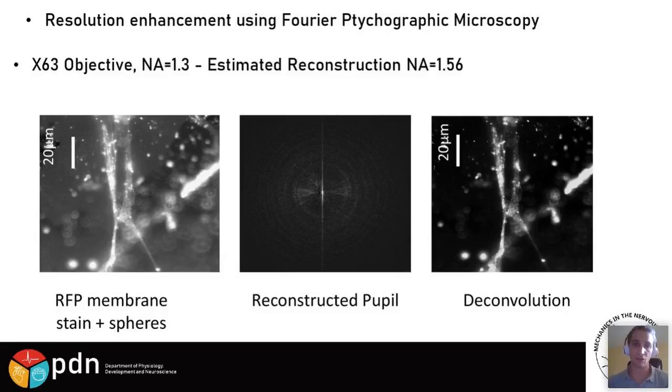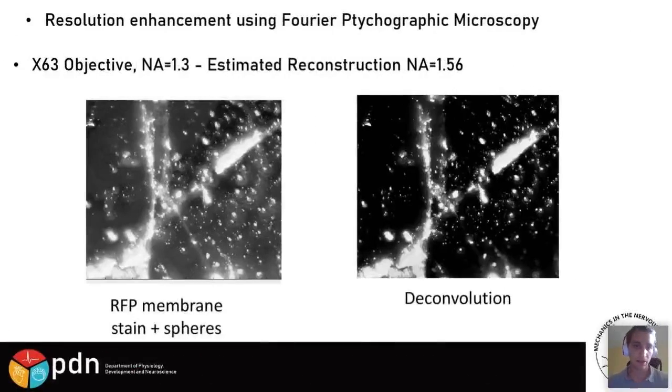Deconvolution with the pupil function, and you'll have a very nice image, and you will reduce the noise significantly. If I had the chance, you could see nice 3D reconstruction images of the fluorescence.